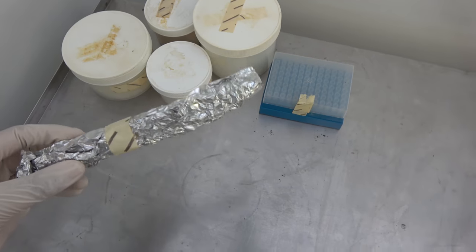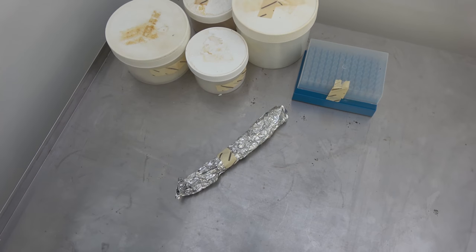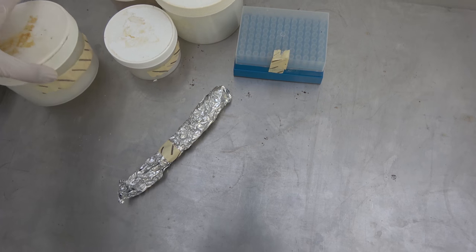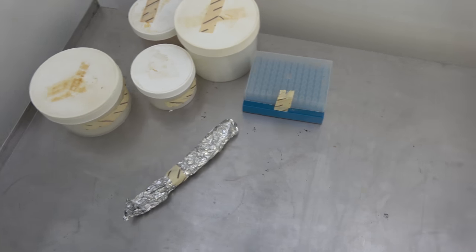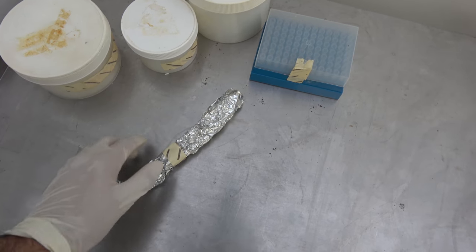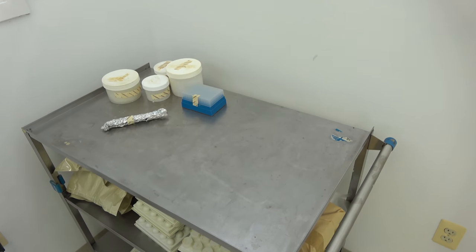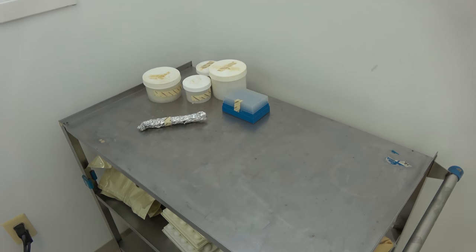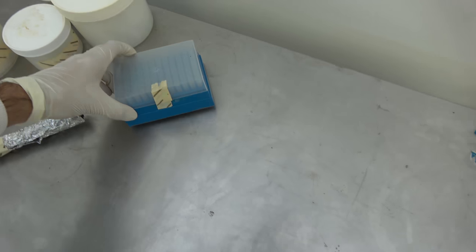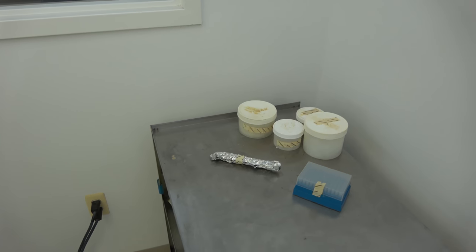These things have been sterilized in the autoclave. And you can tell because it has this tape with the black lines on it. Now before you put anything in the autoclave, whether it be physical material like these tubes or liquids in the bottles, you want to put autoclave tape on it. Now the autoclave tape normally looks blank, but after it's been autoclaved, these black lines appear, which are there to indicate that it's been autoclaved. Now with autoclave material, you don't want to just scatter it around with the rest of the stuff in the lab. You want to have sterilized material in its own place, away from everything else, because you're still treating it like it's sterilized. And general rule of thumb, for example, once you open it, it's done. It's not sterilized anymore.